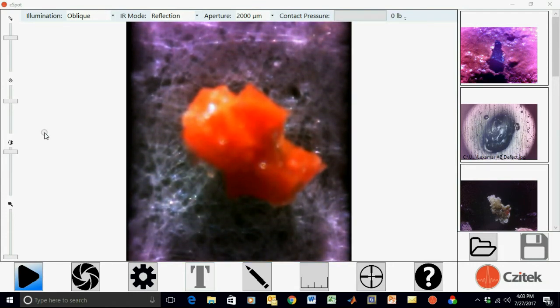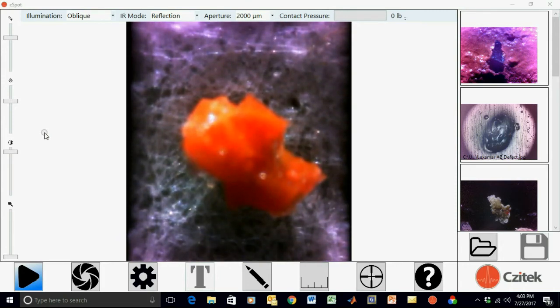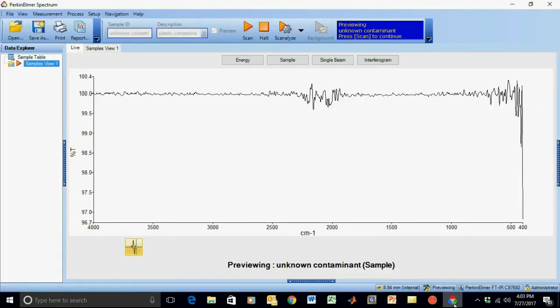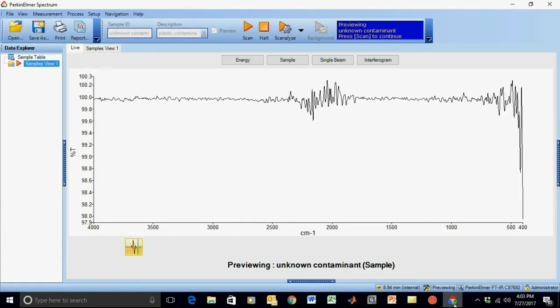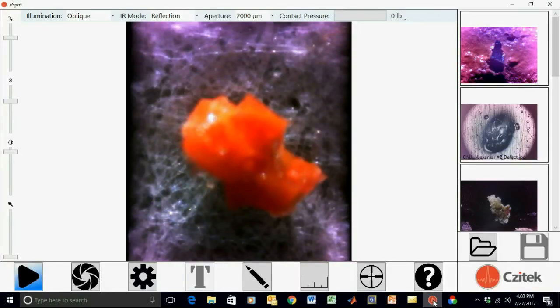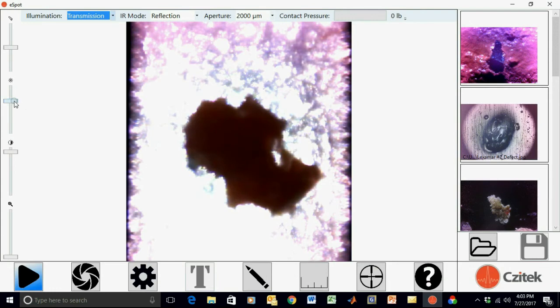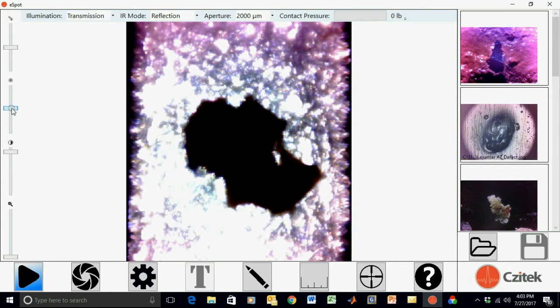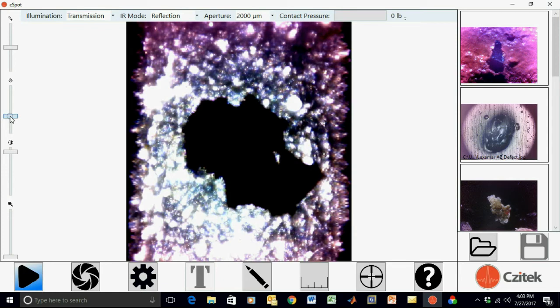The sample is focused and positioned viewing through the Diamond ATR. Sample spectrum preview is selected in Spectrum software. We are now ready to record the spectrum of the sample by making contact with the Diamond ATR crystal. We select transmitted light illumination detection to better view contact with the crystal. Then we adjust the stage focus to contact the Diamond ATR element.